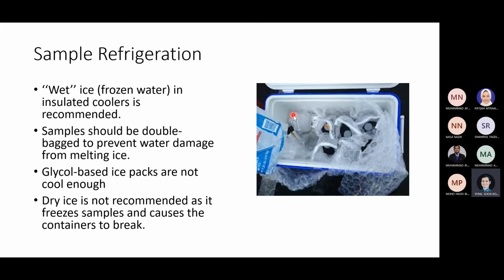Now, when this happens, water helps cool down alongside with the ice, because when the bottle is inundated with water, it increases the contact between the ice and also the bottle. So the cooling effect is much more efficient than without water. So we purposely add water, but not until it fills out. Just enough for them to have enough contact with the bottle.